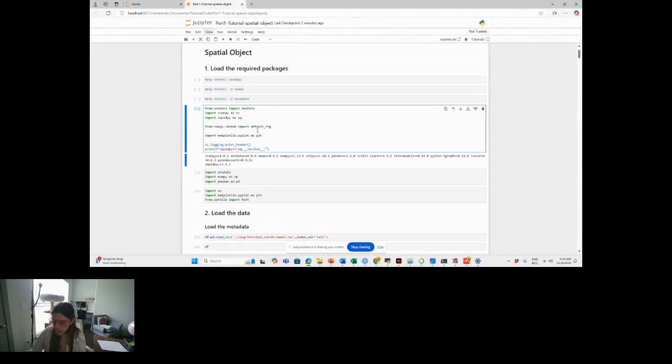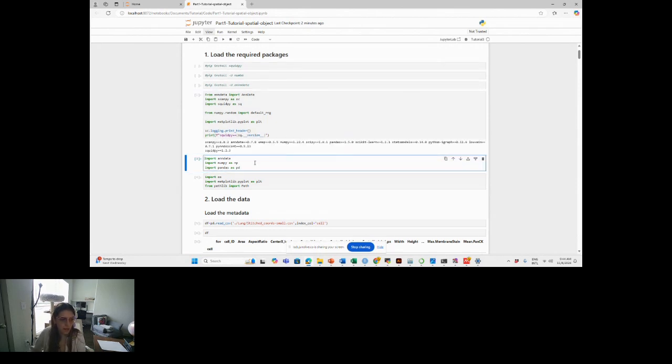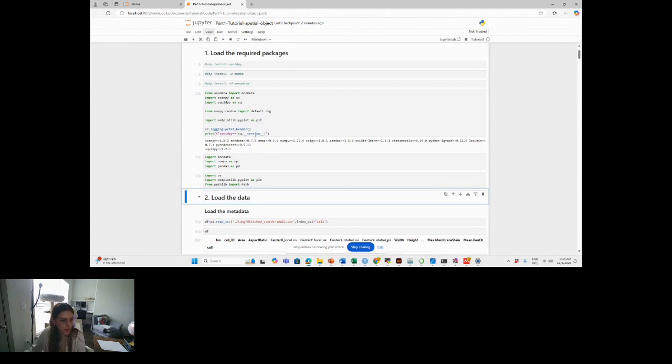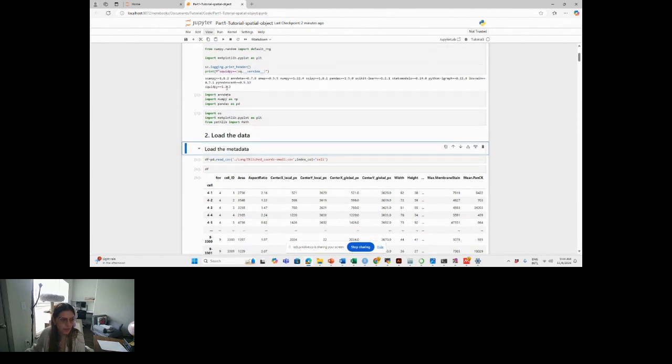We're going to start loading the packages so you can run it. There are 2 ways to run stuff in Jupyter Notebook. You can either just type the run, or you can do Shift Enter by selecting a cell. Okay, so you can see how packages loaded good. You continue loading packages. But let's go and explain a little bit the libraries that you are using.